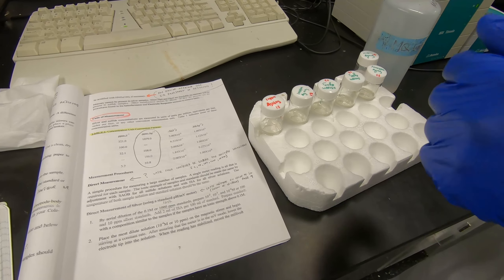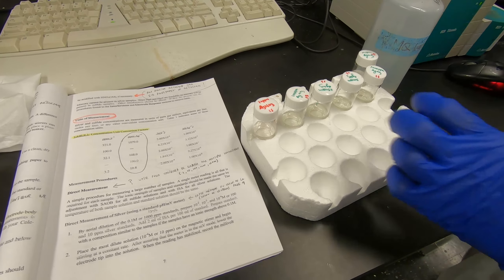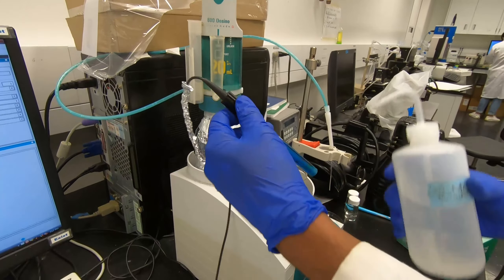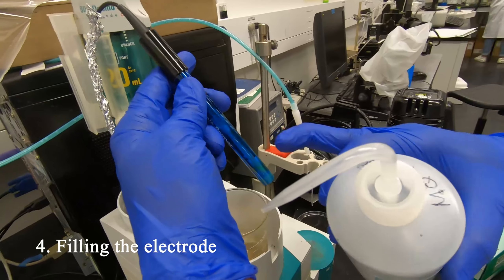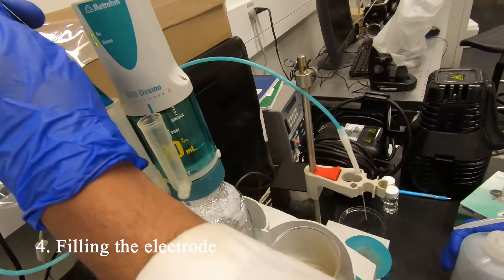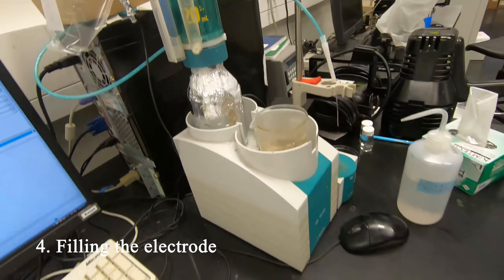This is the electrode. We have to dry it first, wash it with water, make sure it's open, and the electrode solution is okay. Do you need to fill the electrode solution? I think so - it's very low.